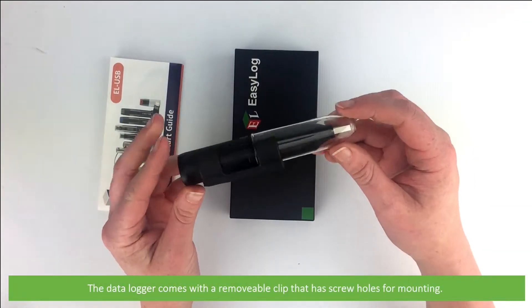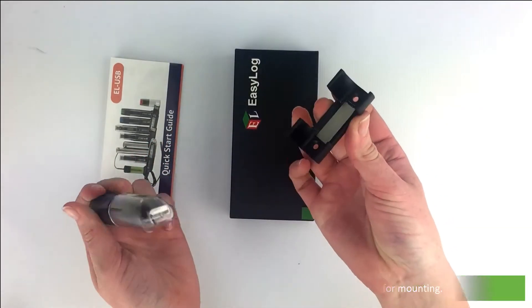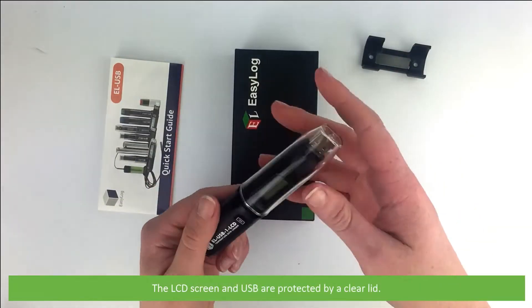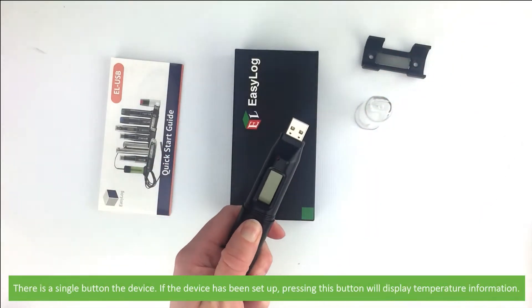The data logger comes with a removable clip that has screw holes for mounting. The LCD screen and the USB are protected by a clear lid. There is a single button on the device.